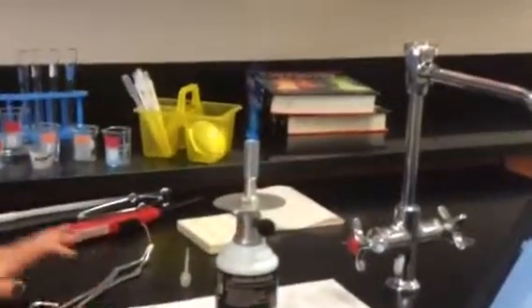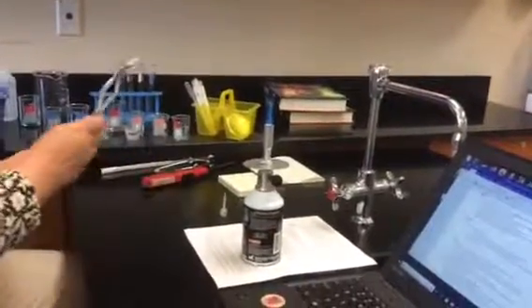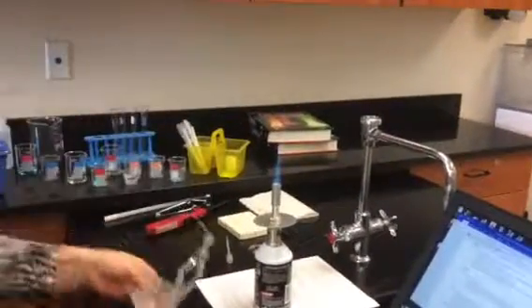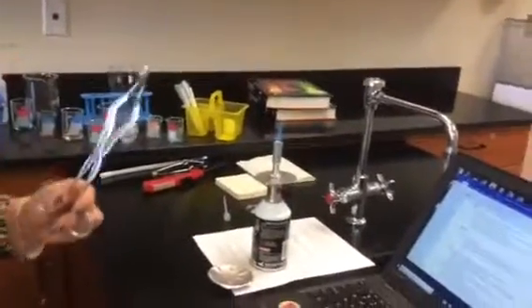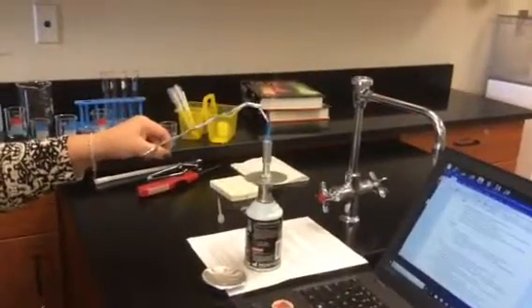And actually, we're going to do this one now, because you can watch it online, but you can't watch it when you're right here. So close your eyes as you record. What, can I look at it through the iPad? No. So you're going to put your watch plate with aluminum foil down. No one look at this, okay? You just can't look at it. So you're not looking? I don't want you to get blinded.